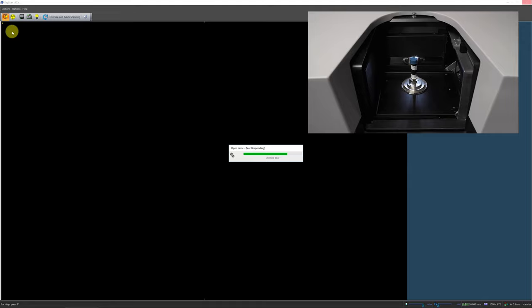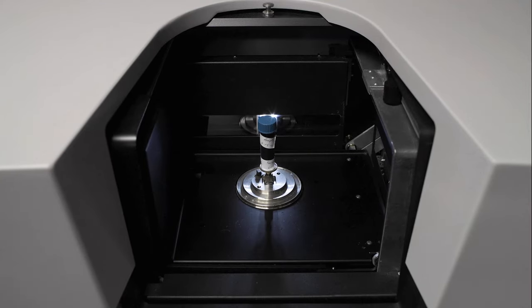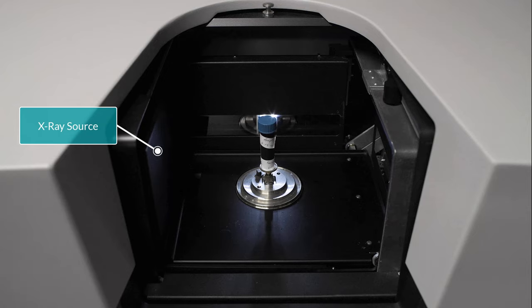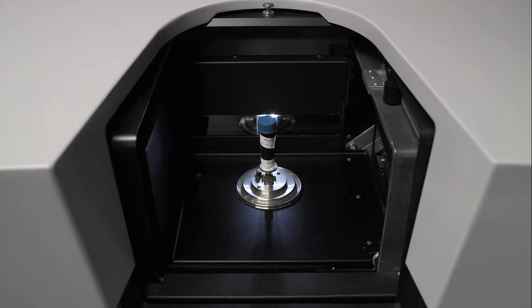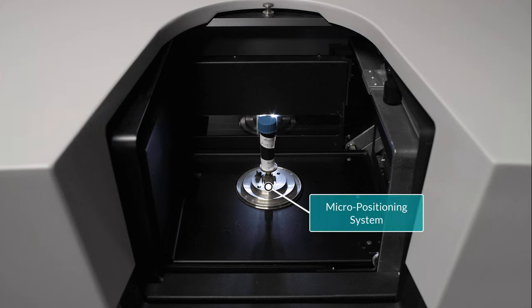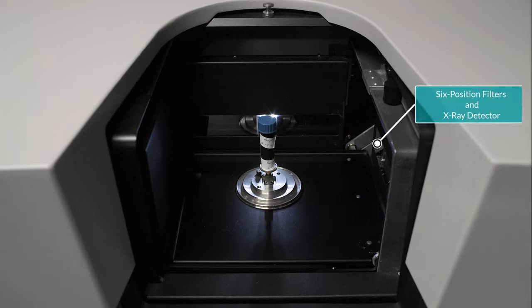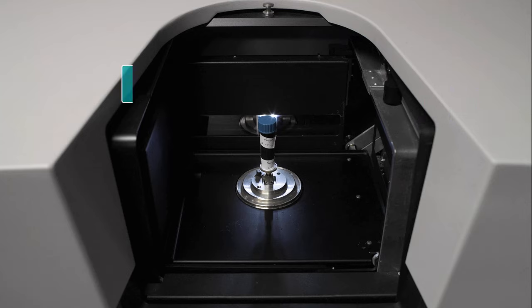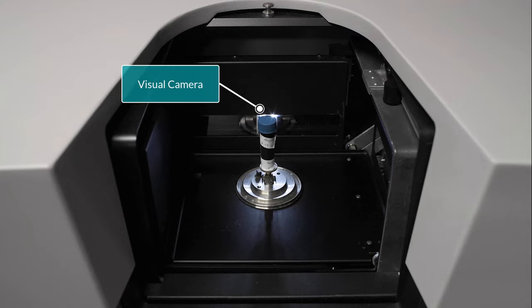Before we proceed further, let's first take a look inside the sample loading chamber. The Skyscan 1272 is equipped with a maintenance-free x-ray source with adjustable peak energy between 20 to 100 kV, an object manipulator for positioning and rotation of the object during image acquisition, a 6-position automatic x-ray attenuation filter changer in front of the 11 megapixel x-ray detector, and a visual camera that looks directly inside the chamber to help you locate your sample.